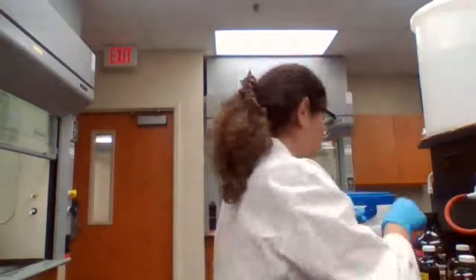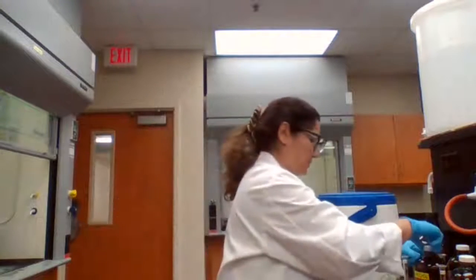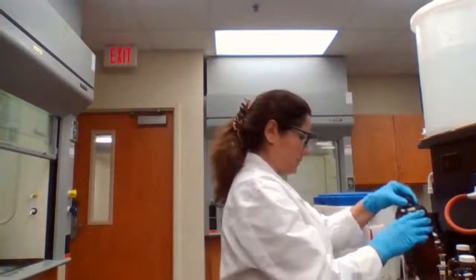Please take a clean test tube and add 1 milliliter of 0.1 molar potassium chromate. So we're just going to add 1 milliliter of potassium chromate. I have my goggles on, have to make sure.